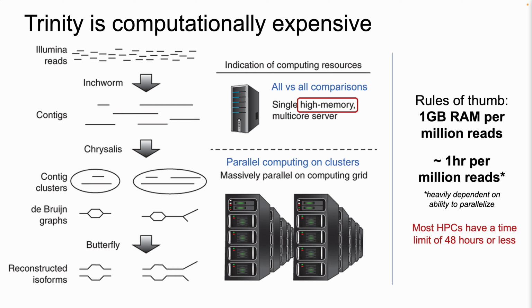The other thing is Trinity has been around for a while. So if you get it all installed with all the dependencies working, it really is just like a Colab notebook in the sense of you execute it and you get transcripts out at the end. The challenge, like I said, is that it's computationally expensive.